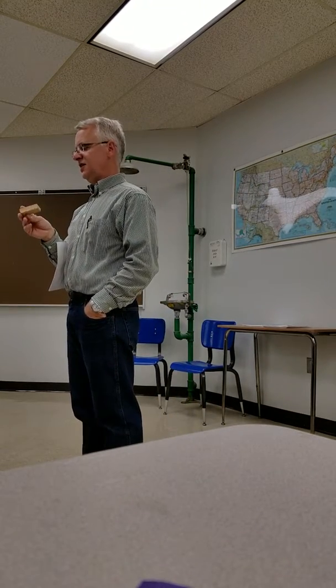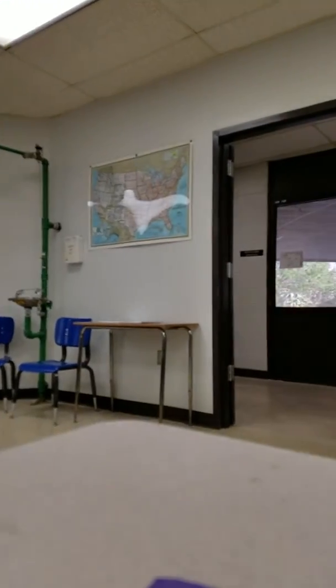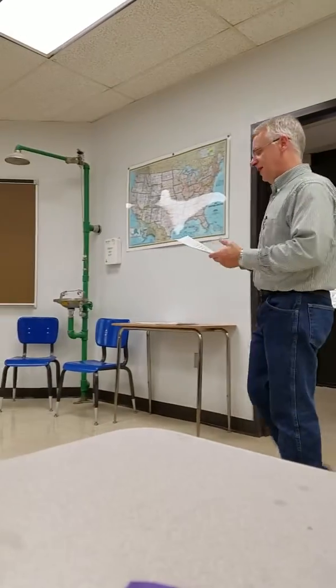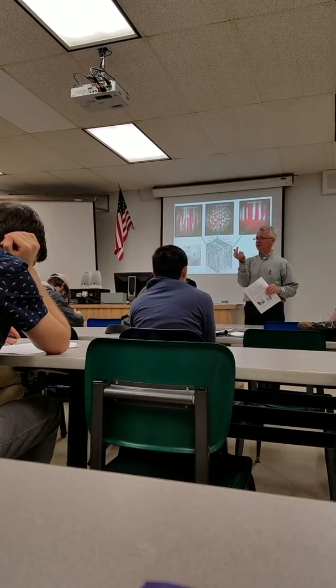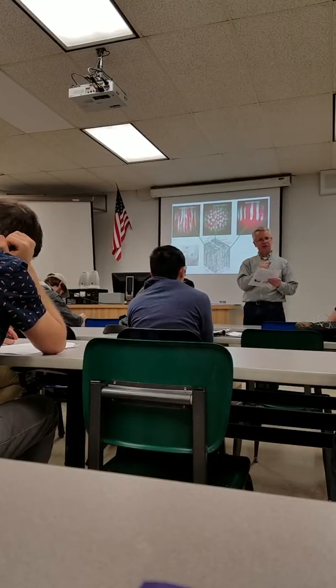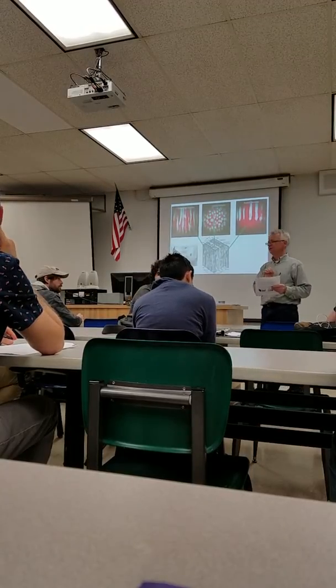Rays are really prominent in oak. So you can actually see the rays. When you look at this section, there's little dark flecks. Those are rays. Okay. So I'm wanting you, here, to start building a relationship and a recognition of how those microscopic cell types and arrangements result in what a piece of wood looks like. So you can either take a picture just of the wood face directly with your phone, or you can use a dissecting scope to zoom in a little bit. It's up to you, whatever you think makes sense.